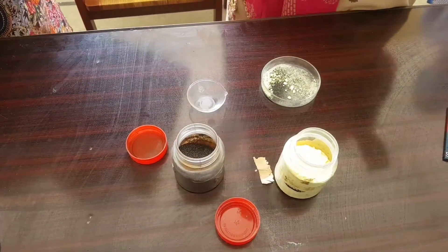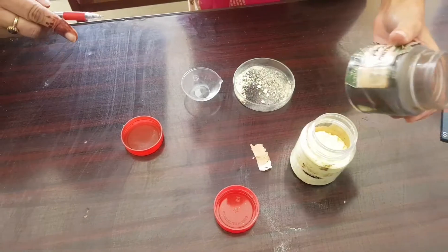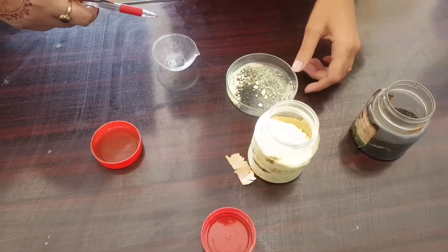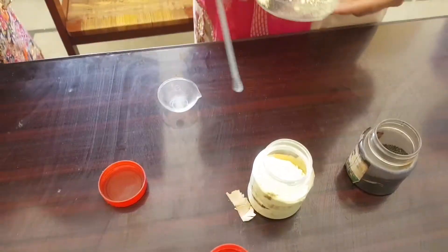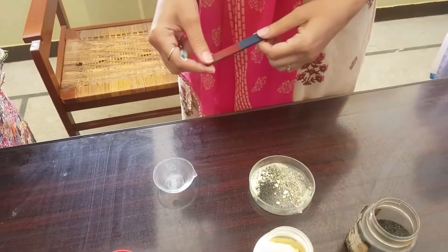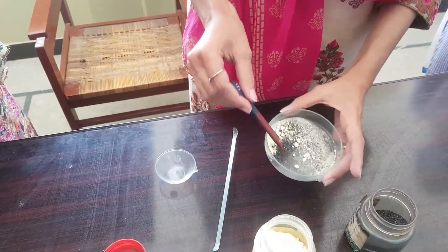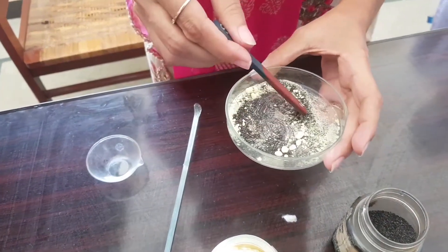I take a small quantity of the given mixture of iron fillings and sulfur in a china dish and watch glass. Now I take a magnet and move the magnet into the mixture. The magnet picks up the iron fillings.